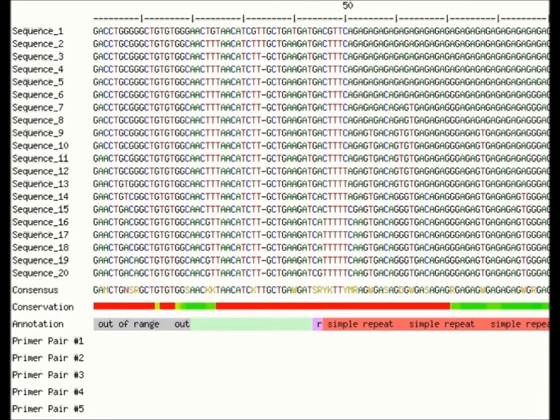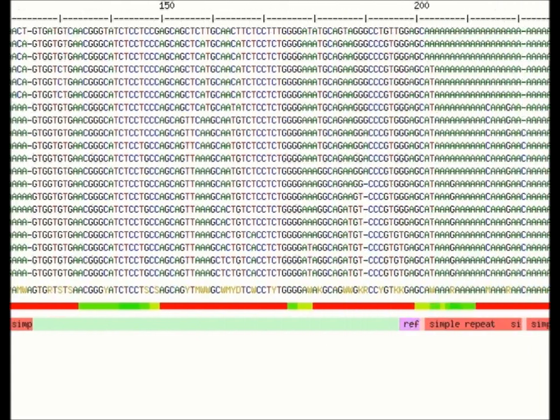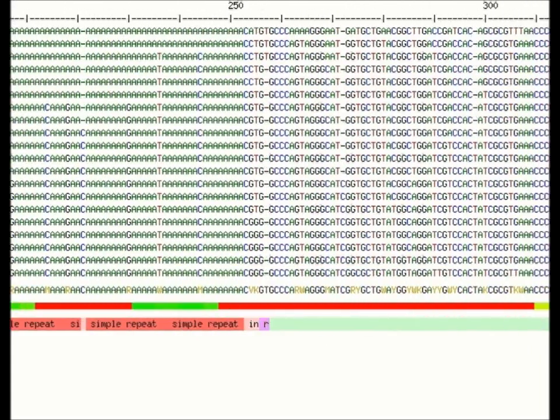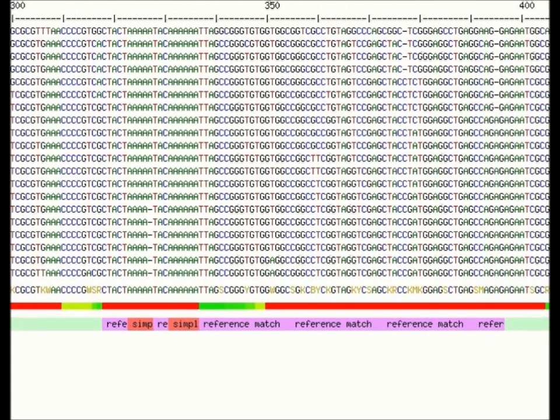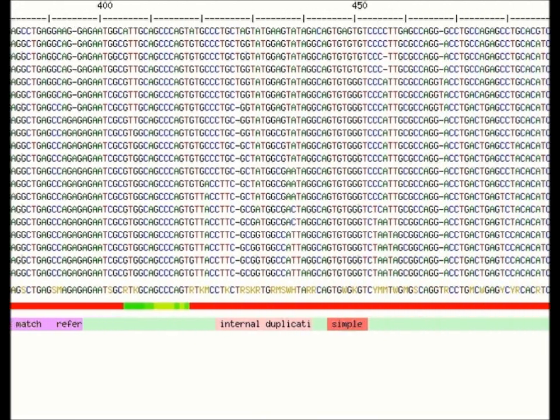Here you can see the graphical output which contains the alignment, the consensus sequence, a bar that indicates sequence conservation, and a bar with further sequence annotation. Besides stretches of simple repeats, it also shows parts of the alignment that match to the reference, in this case a collection of transposable element sequences.